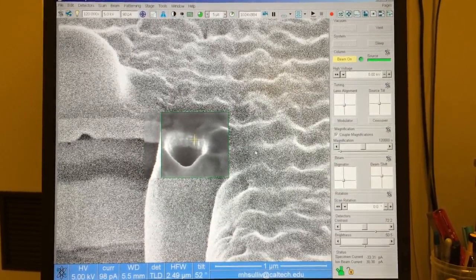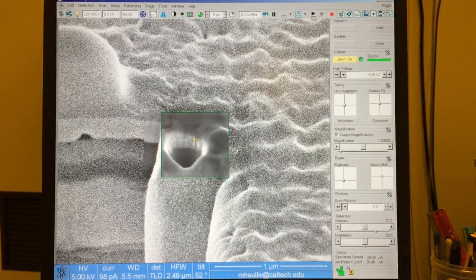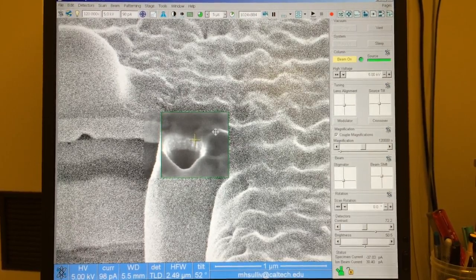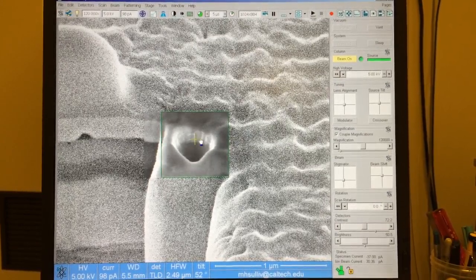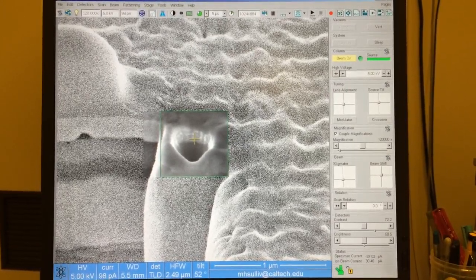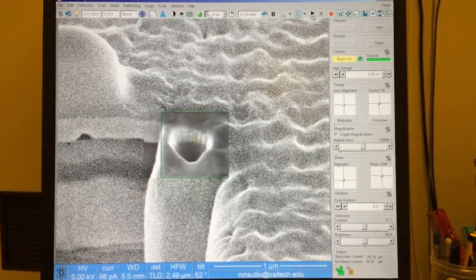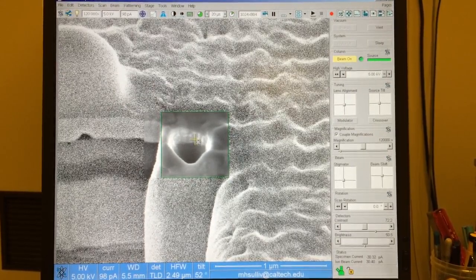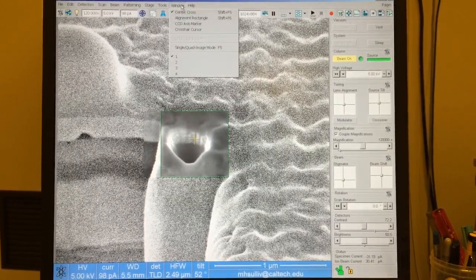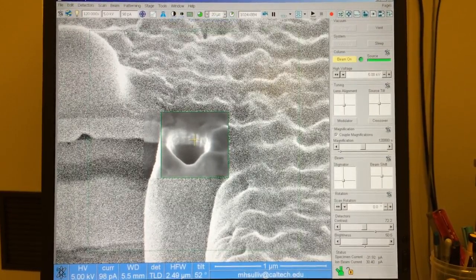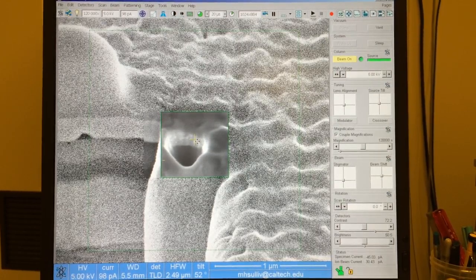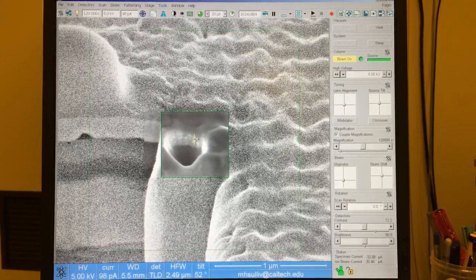The problem is, especially when I'm doing astigmatism, I can move the mouse several inches on the screen, and it's hard to decide exactly where the perfect place is to leave it. So what we're going to do in this video is take advantage of a longer dwell time — something like 20 microseconds — which will give us an even clearer image of the texture we're using for our alignment. Then by using what's called the alignment rectangle under the window, placed on the green dotted line, we'll be able to make comparisons using visual cues on the screen and our mouse as we slide back and forth, allowing us to more precisely tune the focus and astigmatism.